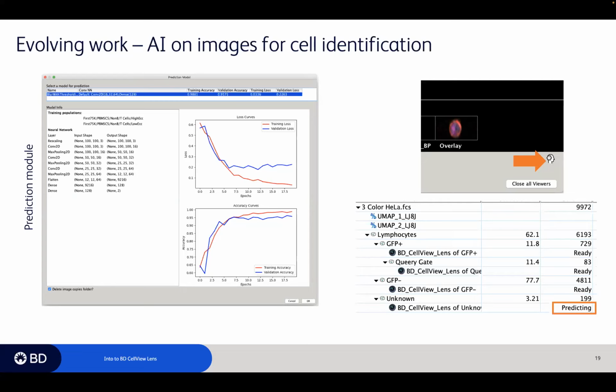Please find the ones that have a lot of green fluorescence or pink fluorescence or whatever it might be, or a shape that looks like this, or one cell as opposed to two in a plot. So that is our future direction.